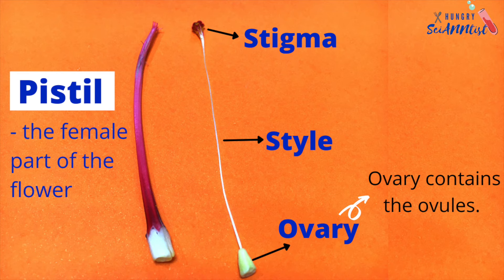Pistil — it is the female part of the flower. It has three parts: stigma, style, and ovary. Ovary is the part that contains the ovules.